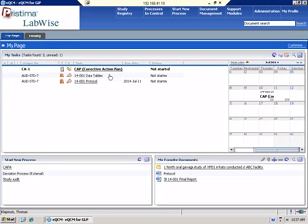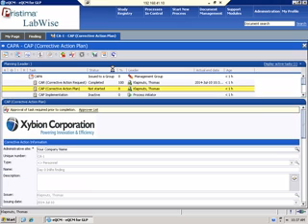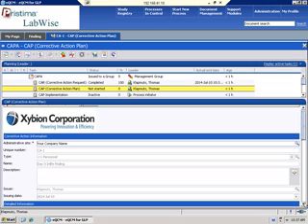In this case, I'm part of the life cycle, so the corrective action plan is forwarded to me. When I click on this, again, it shows you the process up here. So the request was completed, and now we're on the action plan. And again, here I have the action has to be approved. And again, you can define the various steps of this process. So see here, all the information is now grayed out because I can't edit it.